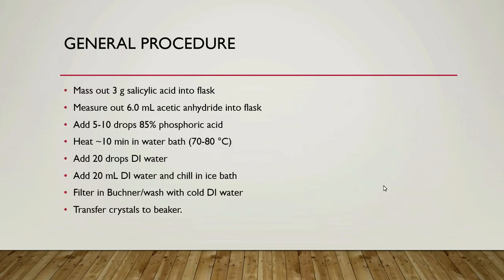An abbreviated version of the synthesis was taken from the Cal State Stanislaus Chemistry website back in 2013. This is a very common synthesis that is performed either late in general chemistry or early in organic chemistry. Sometimes it's even performed in high school AP classes. We see on the next two slides a summary of the procedure that we'll be using to score the risk assessment tool.